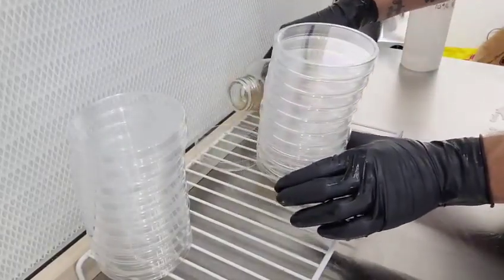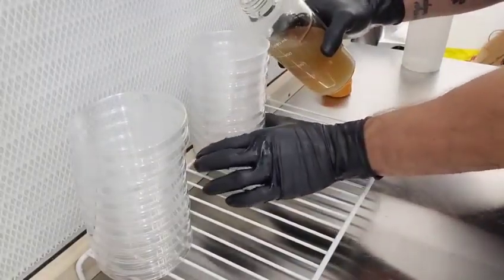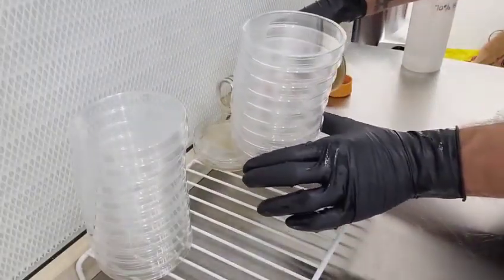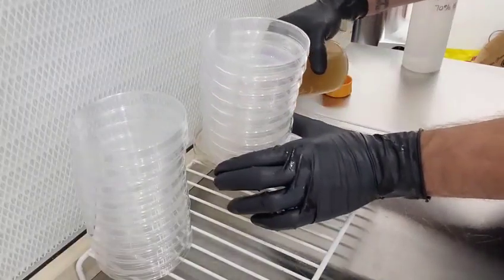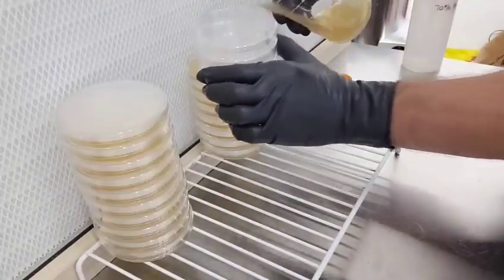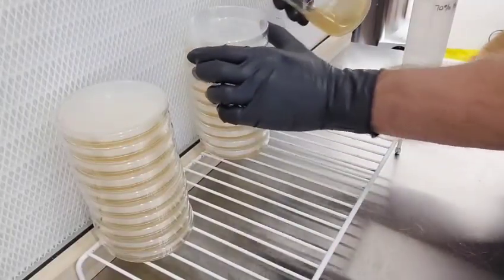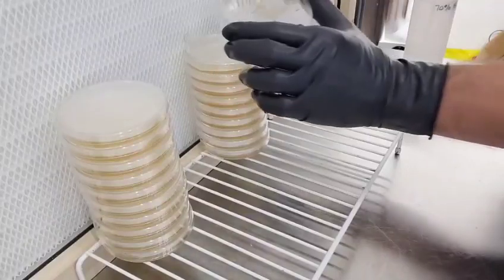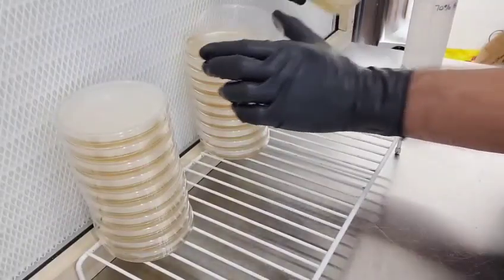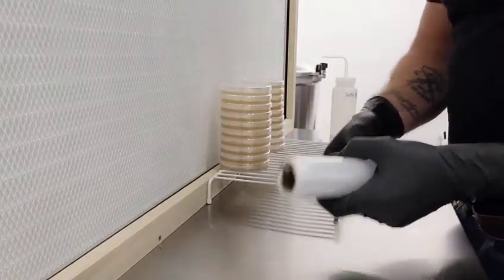I'm going to show you what I'm going to show you today. This is how I wrap my plates for storage.